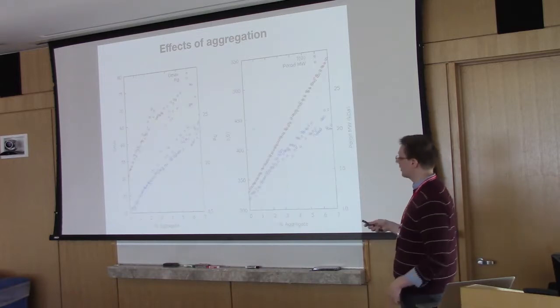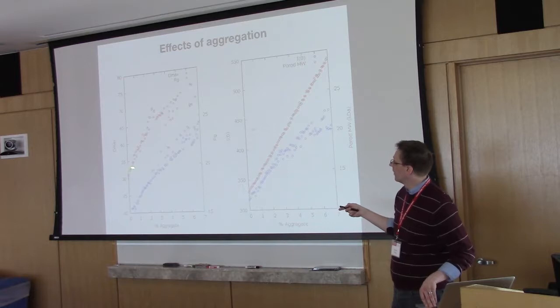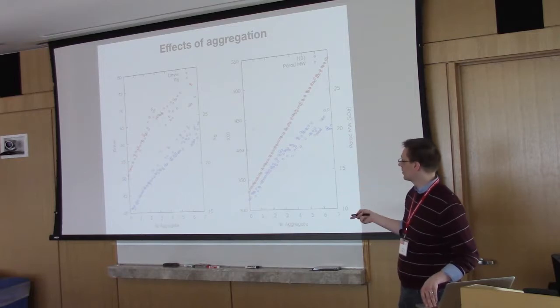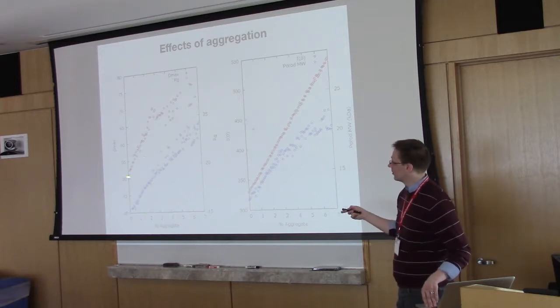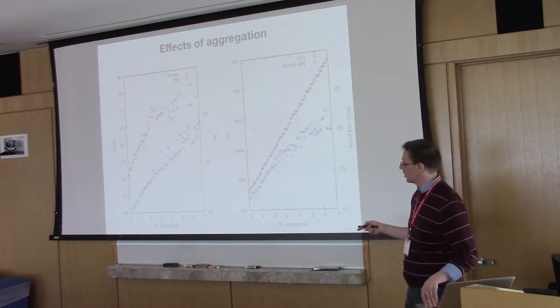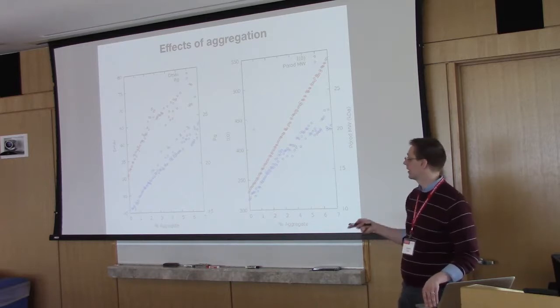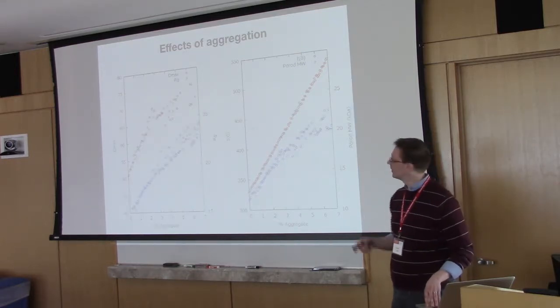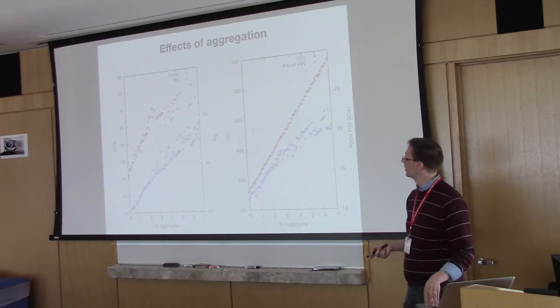There are also some effects of aggregation that you can test with things like Dmax and RG. You can see that Dmax increases quite substantially. Remember, at maximum here, we're only talking 7% of your sample is aggregated. Even at just 1% of your sample, you've increased by some 5 to 10%. So it's pretty significant. Your RG increases significantly. Your I0, which is directly a function of your average molecular weight, increases, as well as your Porod molecular weight. And so you can see that you're going to screw up your analysis if you don't have a nice pure sample.